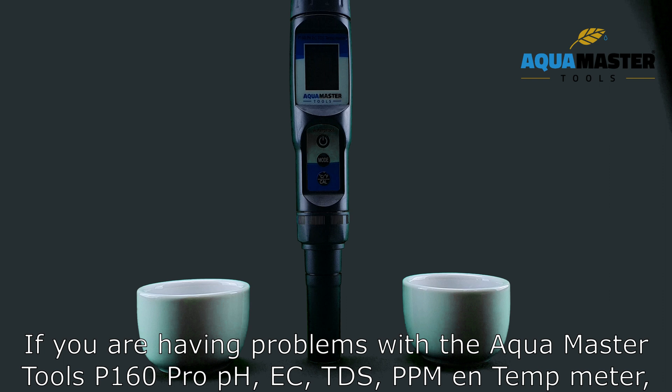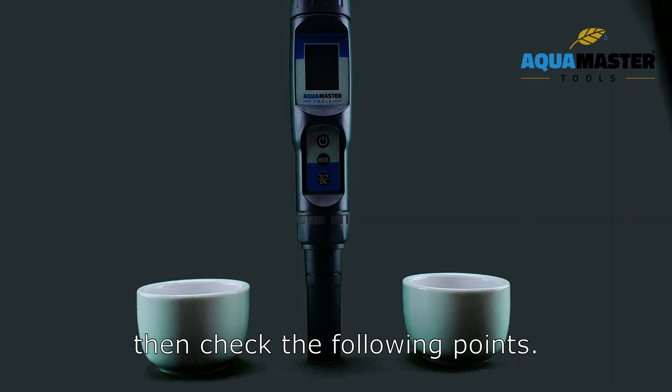If you are having problems with the Aqua Master Tools P160 Pro pH, EC, TDS, PPM and temp meter, then check the following points.